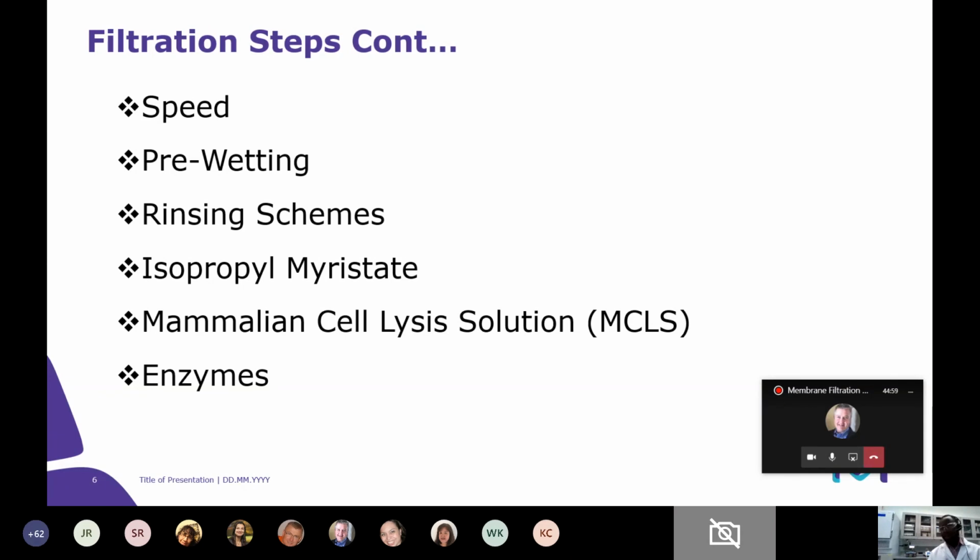I know it's easier said than done because you don't want to use too many resources, which is why some people outsource the method development part of these microbiology tests. It could be time consuming and very tedious. Sometimes you want to let your staff work on other things, especially if you're doing release testing. Having to spend this much time on method development can be challenging. Resources can be challenging.